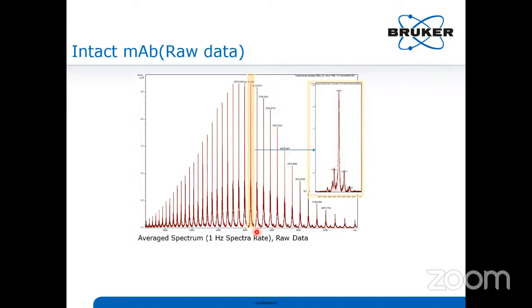When you are analyzing your samples in mass spec, every time it won't generate only a 1 plus charge state. Sometimes it will generate 2 plus, 3 plus, 4 plus, 5 plus. It may go until 50 plus, 60 plus also. As I mentioned previously, in mass spec you are not going to measure your mass directly as a Dalton. You are going to activate your molecule and give some charge state to it. By calculating the charge state, you will confirm your mass.